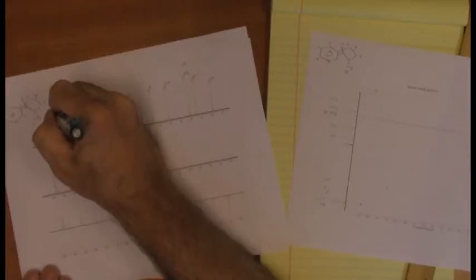We'll come back to that in a moment, but I have gotten these labeled, and yes, it's not a bad idea to label that peak position. I know that one is position 10 here. I also know that one is position 5. Yes, indeed, I know that is position 10.